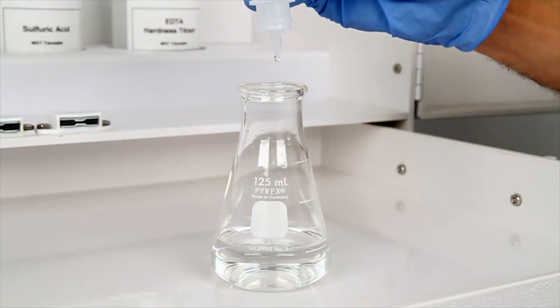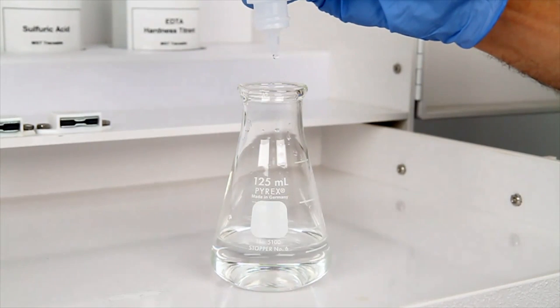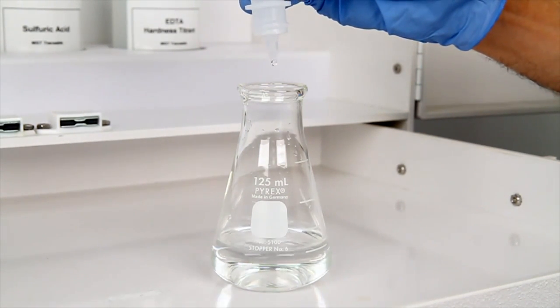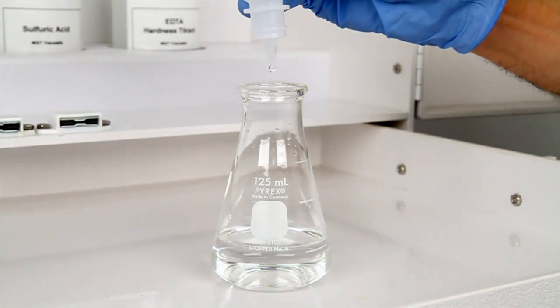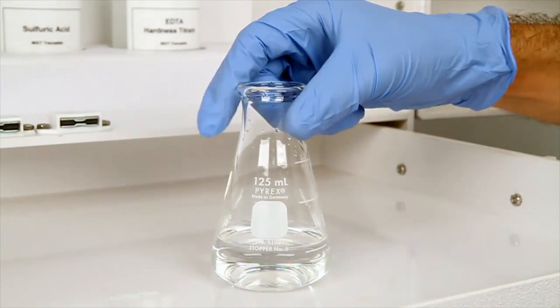The next step is to add 30 drops of hardness buffer. Hold the bottle vertically to get a consistent drop size. After the addition of the reagent, swirl to mix.